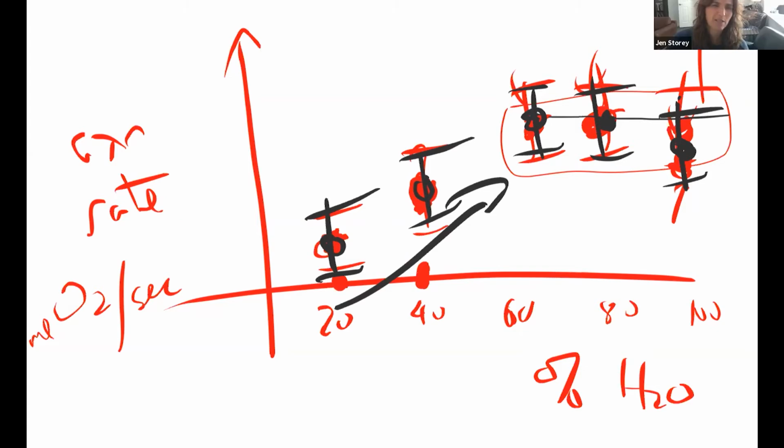The two of mine that were actually the same were the 40 and 60, and then it jumped up at 80. But I still think that pretty much supports what I was thinking. And I would say there's also weirdness in the fact that people got their 100% had less, or made less by the end than the other. That's weird. So there are other sources of variability that also make us a little doubtful of how much we can rely on any particular one of these dots.